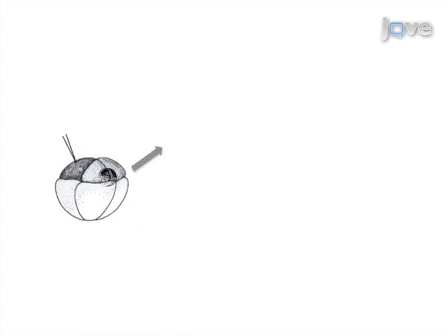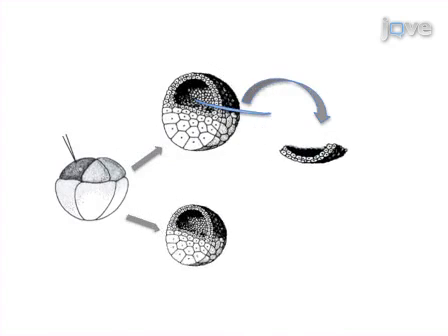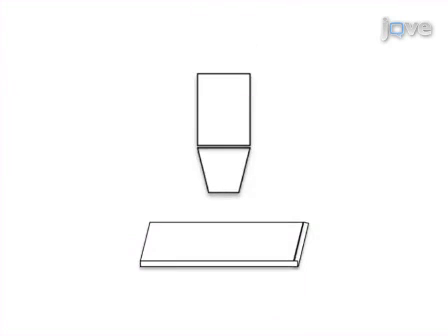Next, ectodermal explants and/or embryo cryosections are prepared and immunostained. Finally, the immunostained cells are imaged using a fluorescent microscope. Ultimately, results can be obtained showing how specific protein subcellular localization depends on embryonic signaling pathways.